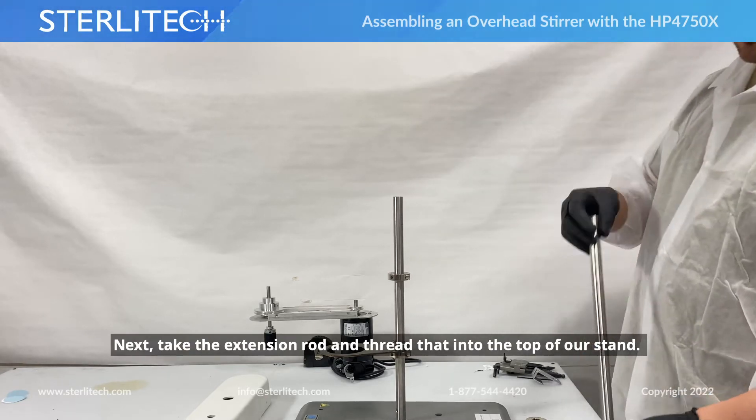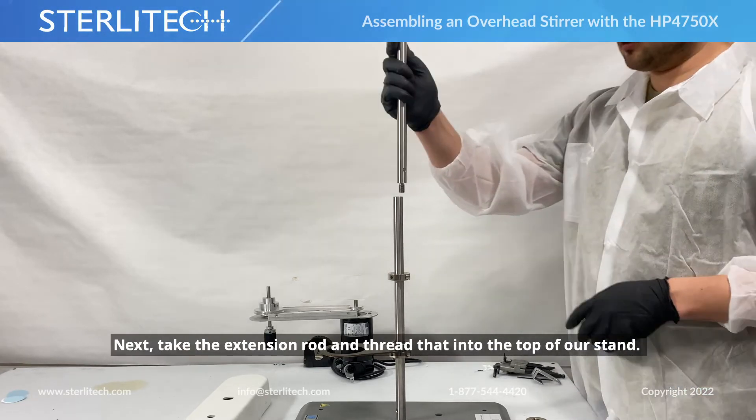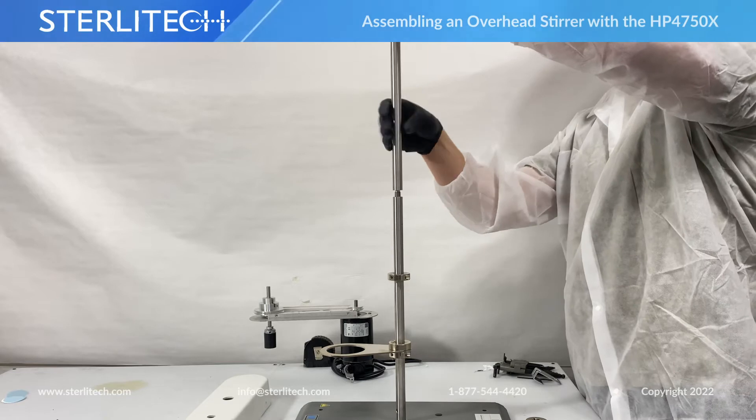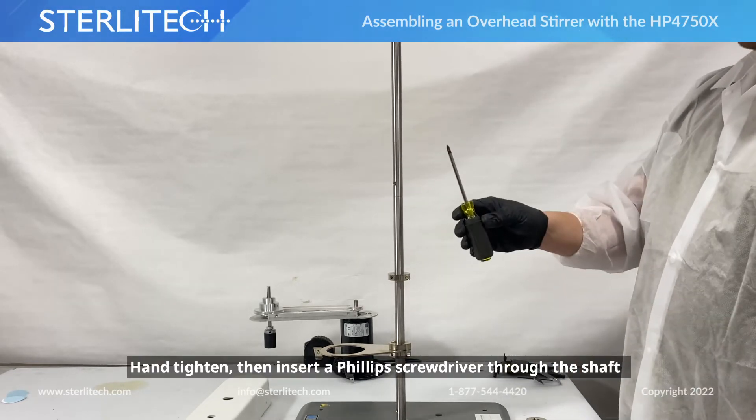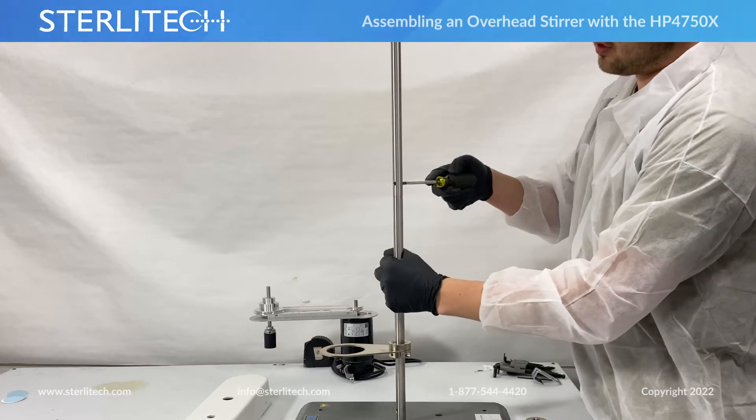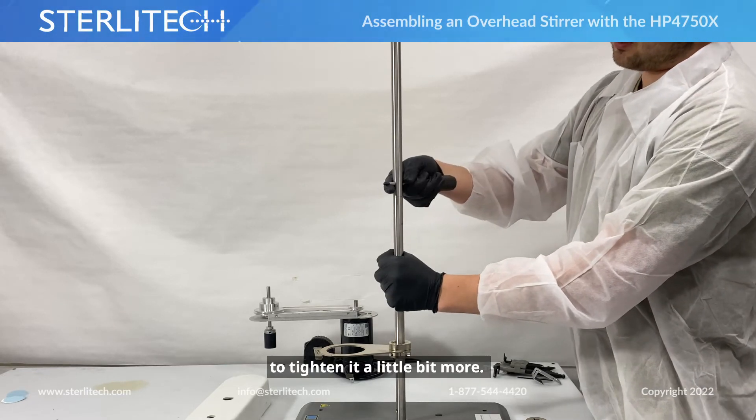Next we're going to take our extension rod and put that into the top of our stand. And tighten it. Then I'm just going to use a Phillips screwdriver, insert that through the shaft, and use that to tighten it a little bit more.